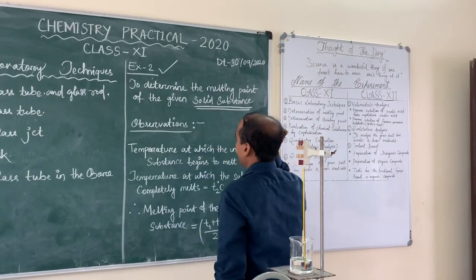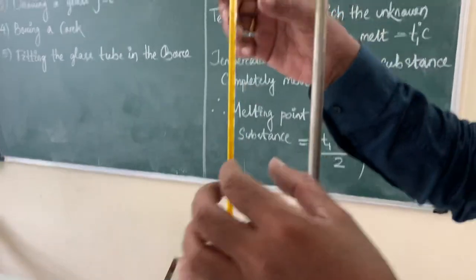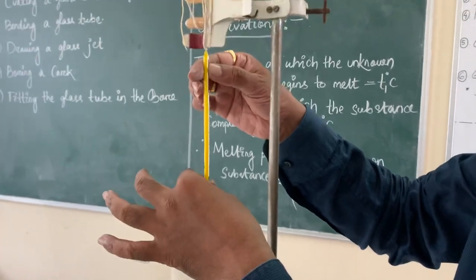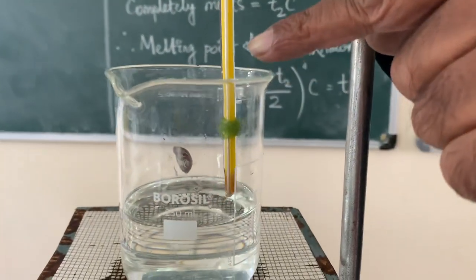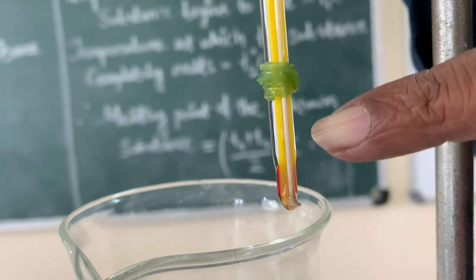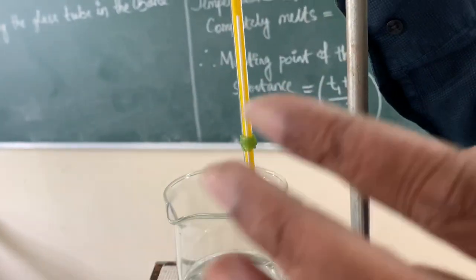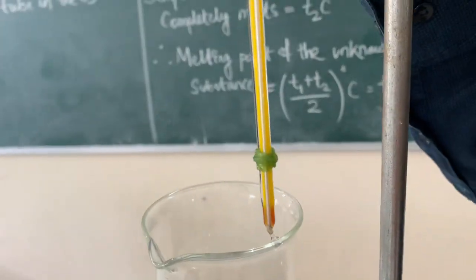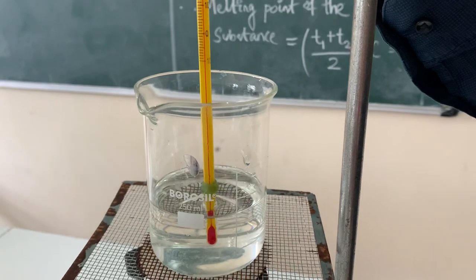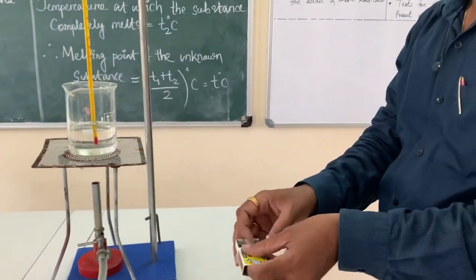The substance will be given to you; you have to calculate the melting point. See the arrangement — you take the camera and see the arrangement. This is your thermometer. You have the capillary tube having the solid inside. I have taken naphthalene as the solid — the teacher will give you the solid and you have to arrange like this. Then you have the tripod stand, beaker, wire gauze, then burner. You ignite the burner and open the gas.